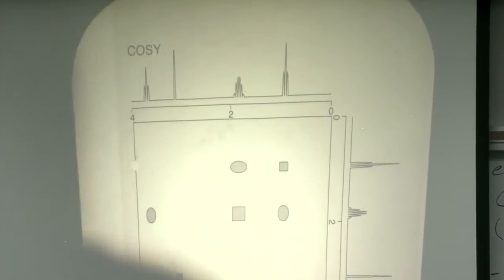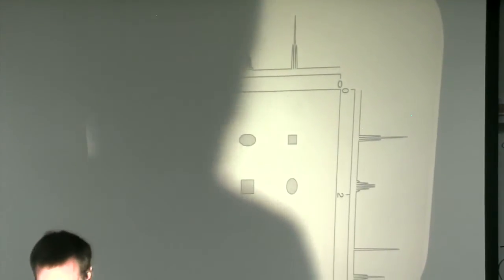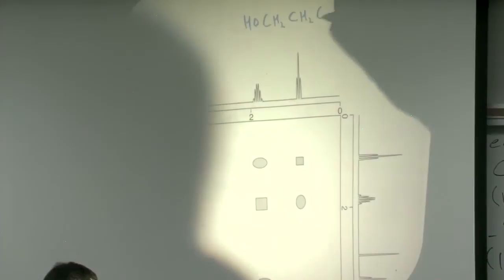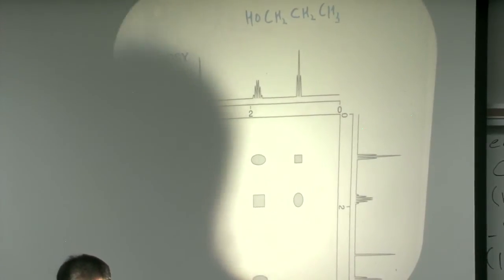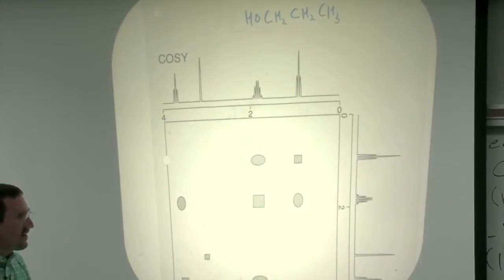All right, so this is not a real spectrum. This is a sketch of the COSY spectrum of propanol. And so it's my little pigeon sketch of it.